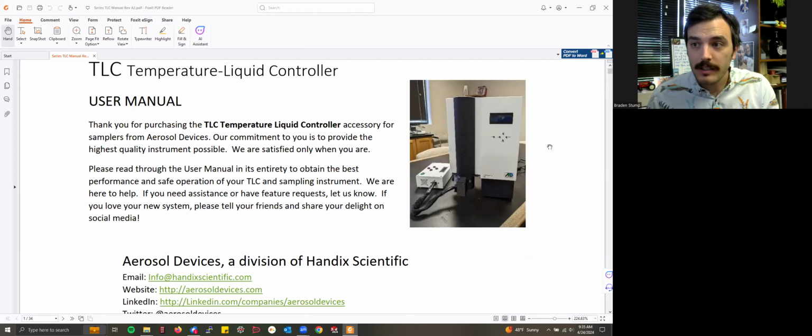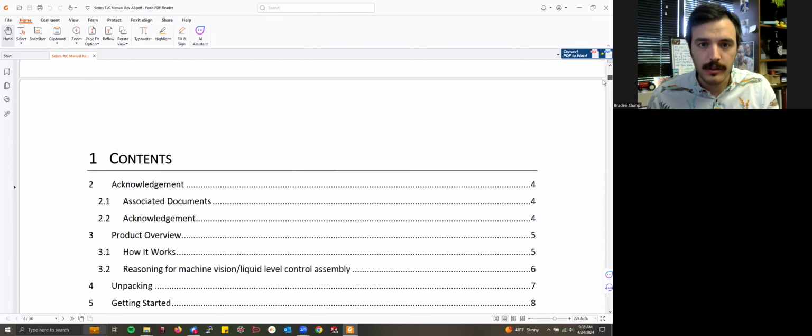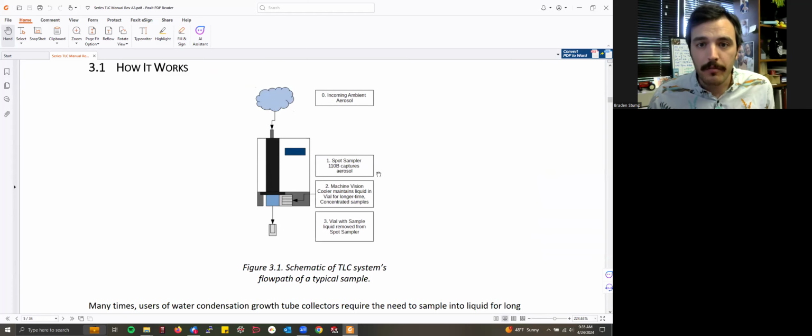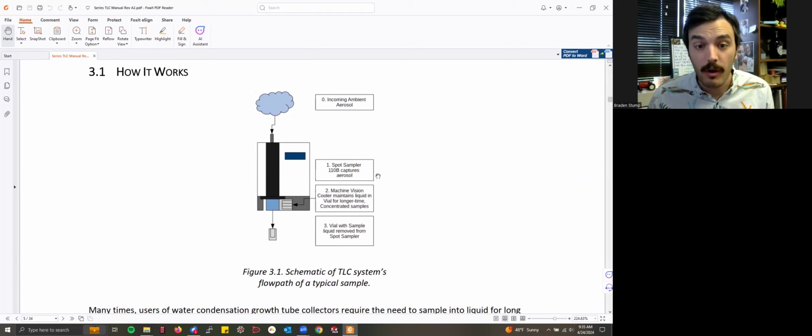So if you've watched some of the other YouTube videos describing how our aerosol sampling technology works, you have probably seen me discuss that one of the things you will have to note when doing a longer length liquid sample with our technology is that you will have to deal with fluctuations in the liquid level of the sampling vial of our instruments. Notably on the BioSpot Gem and on the spot sampler, this is a much smaller volume, a 300 to 600 microliter liquid vial.